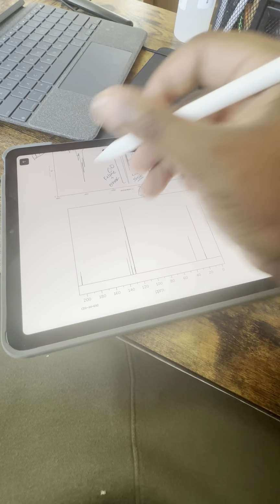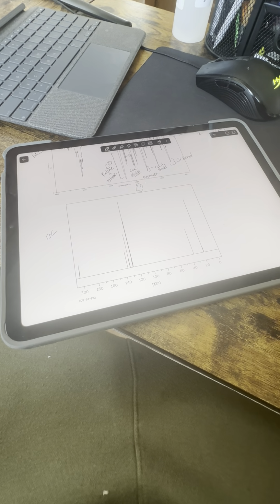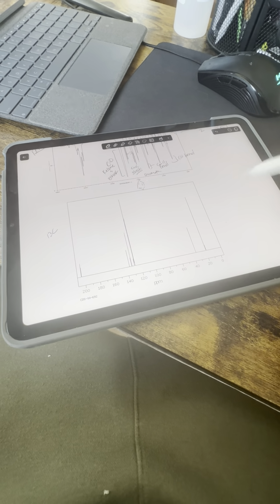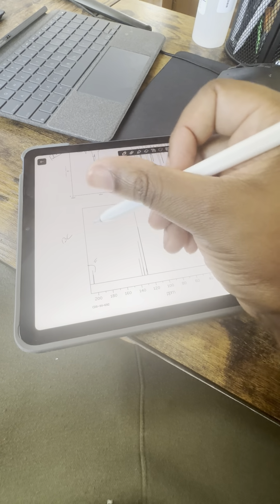Now for the carbon 13 chart, we need to find out if it's a ketone or an ester. A way you can find that out is that an ester lies between 165 to 175 ppm, while anything greater than 200, we know it's a ketone.